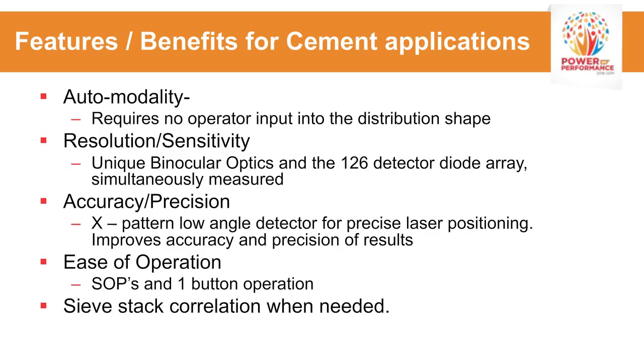On the other side, accuracy and precision are controlled by the angular position, or knowing the angles of light scatter. You basically know two things about your particle size distribution. You know the angle, and you know the amount of light that's being scattered due to your particle size distribution. From that information, the particle size distribution is a calculation, converting that light scatter, utilizing either Fraunhofer or Mie theory, to get the appropriate and accurate particle size distribution.